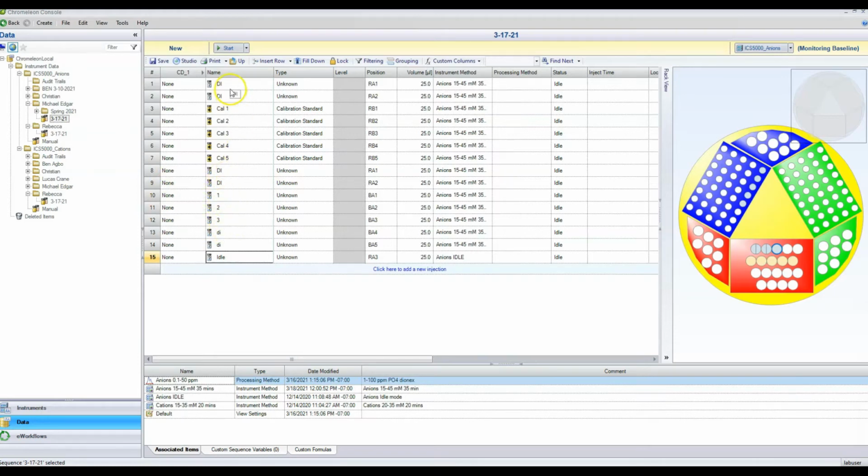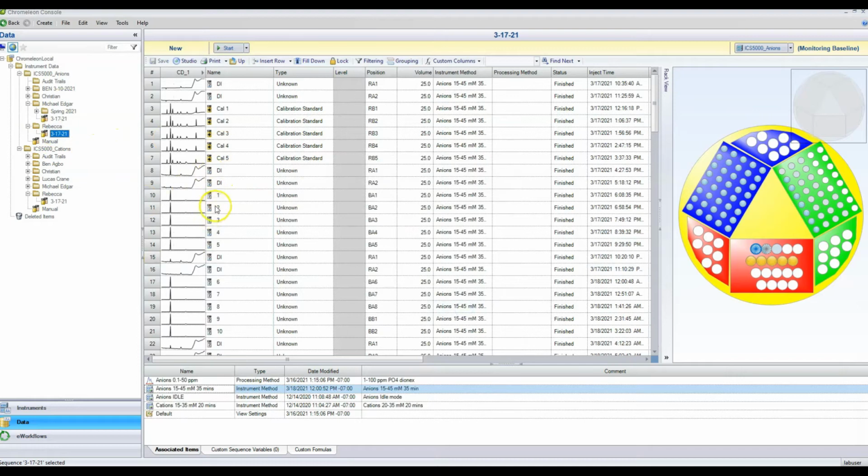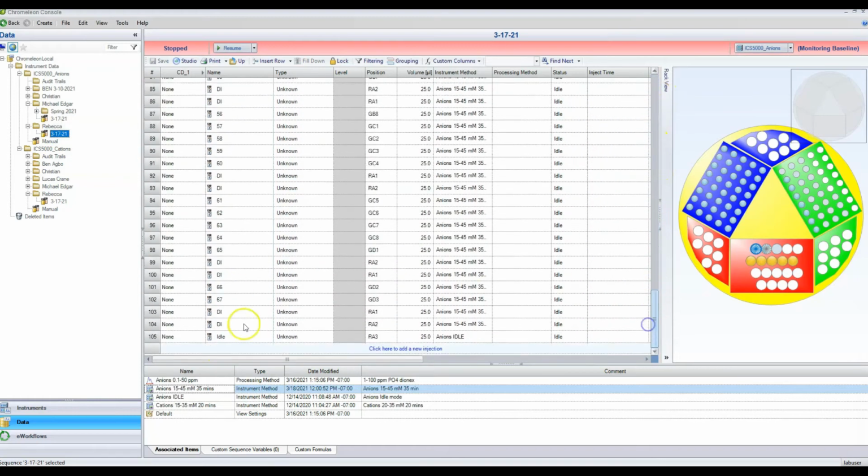So the normal series that you should do this in is 2 DI waters followed by your calibration curve, followed by 2 DI waters, and then you start measuring samples. And when you measure samples, you should go 5 samples, 2 DIs, 5 samples, 2 DIs. If you look here, I'll save that before I exit it. If you look here, that's what you did. 5 samples, 2 DI waters, 5 samples, 2 DI waters. And you just keep that trend going until you end with 2 DI waters and your idle mode.